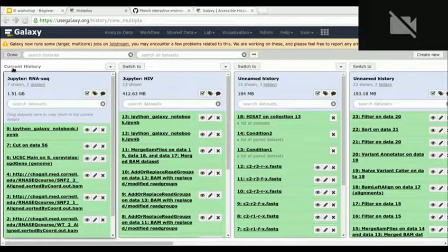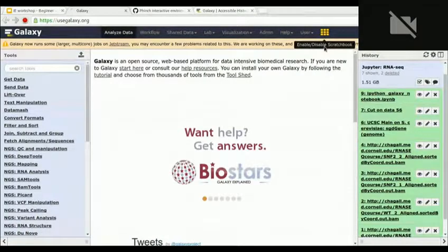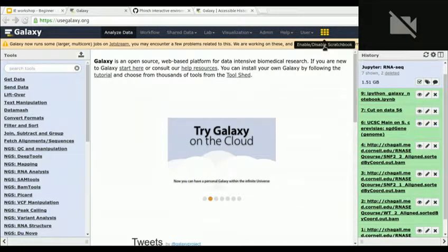We have Python 3, Python 2. We have the R kernel, and Julia is included. But for example, the Perl kernel, I was not able to get installed. But yeah, if you have your own kernel, if you have your own environment, you can just specify this image and take just another image. That's it. One thing Björn did mention is that you can use Scratchbook.